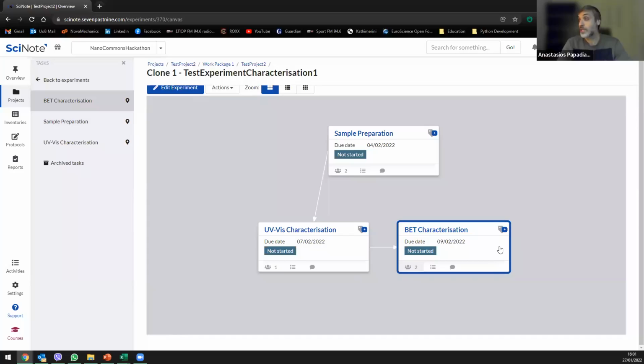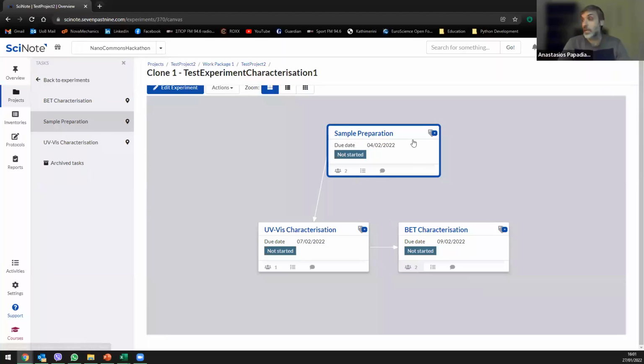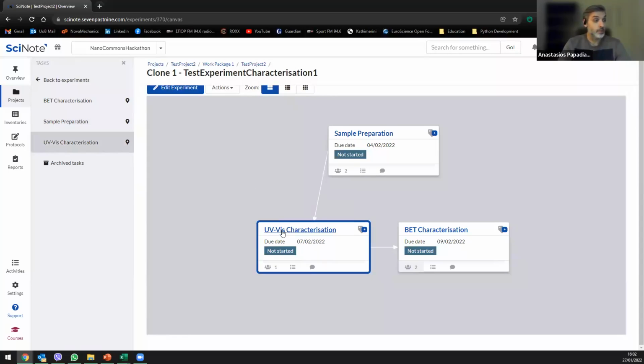No, it's not for project management only. We will see now. Yes, now we're moving towards adding data and setting up workflows for adding data. And so, how we do that.